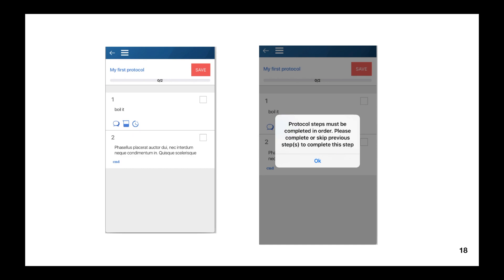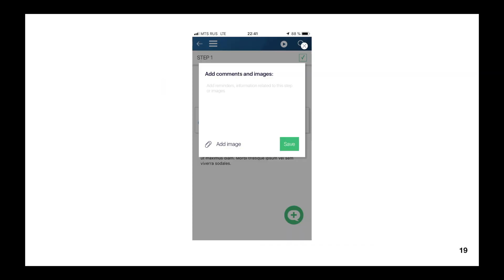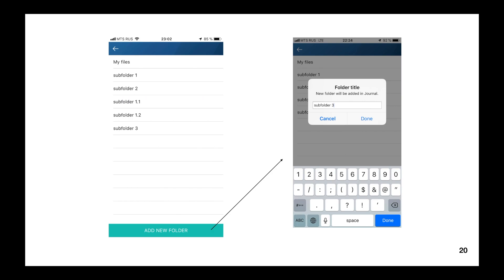When you try to complete a step in the wrong order, you will be warned, because it's not possible. You can make notes to each step — they look similar to comments. A note is just text and an image, but they belong only to you. That's the important difference between notes and comments. When you decide to save your progress, tap the small Save button and you will see a folder selector showing all folders for saving, or you can create a new folder there.